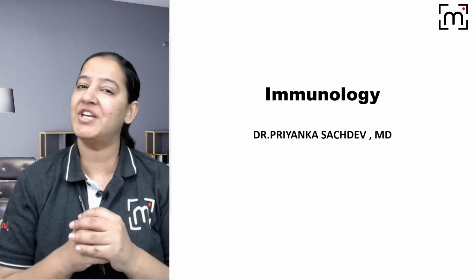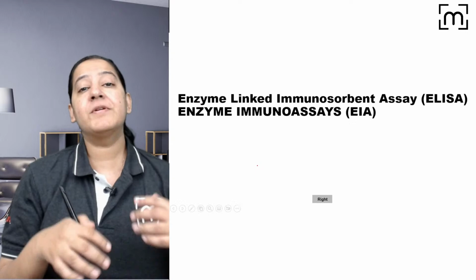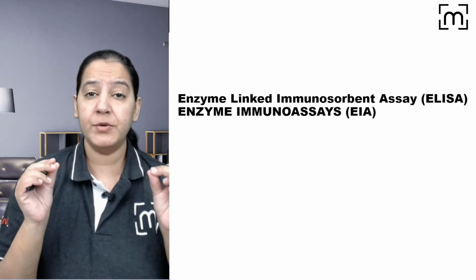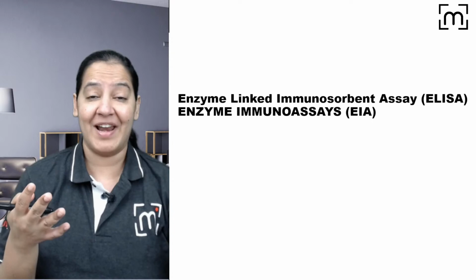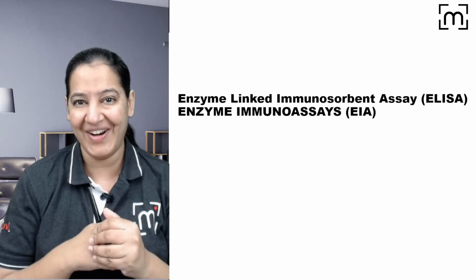Now, many students requested me that they have problems in understanding ELISA, the principle behind ELISA and the various types of ELISA. So today in this session, I will brief you all about ELISA and its various types. What is the principle behind it? What is the use of ELISA? What is the difference between the various techniques of ELISA? So in short, we will master ELISA today, right? So let me start ELISA.